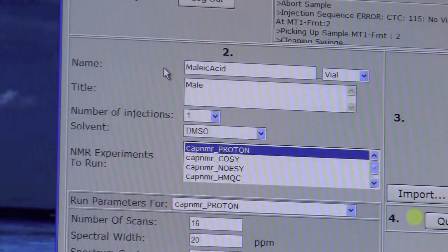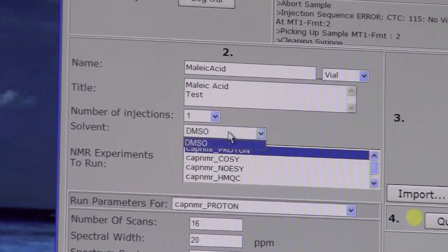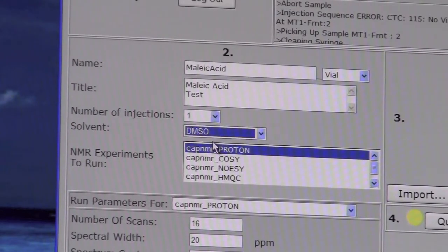You can use whatever you want in here, including multiple lines of text. And then here, choose the solvent. For now, we only have DMSO. We may consider adding more solvents down the road.